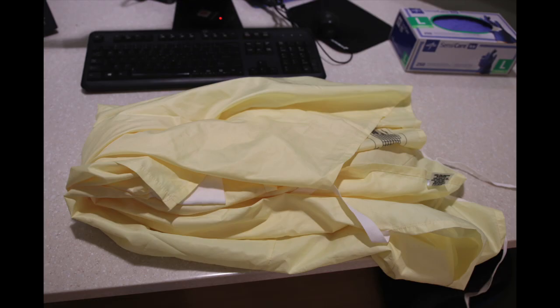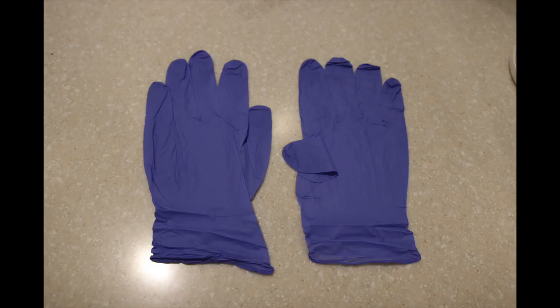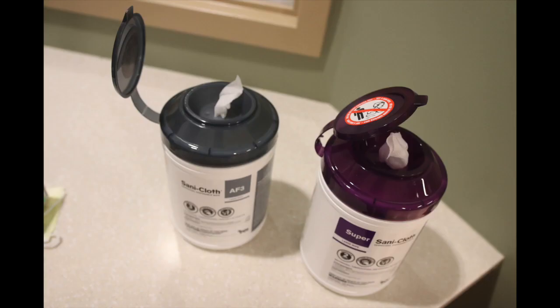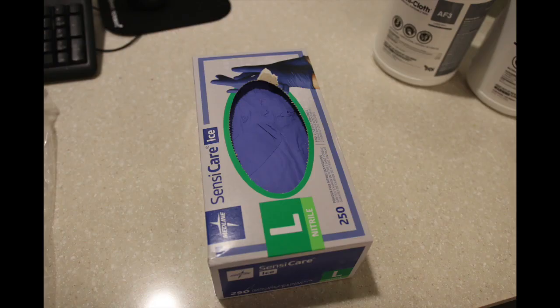Before proceeding, you must ensure that all of your PPE is ready to go. This includes a gown, either disposable or reusable based on current hospital protocol, a pair of gloves, and any other equipment you may need, including a disposable or reusable stethoscope. Please also ensure that there are sanitizing wipes and additional gloves outside the room for when you exit.